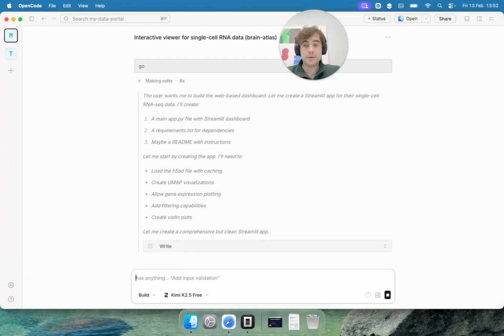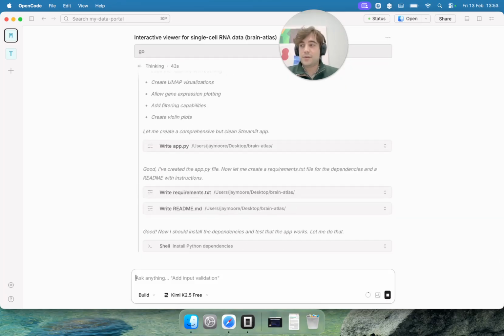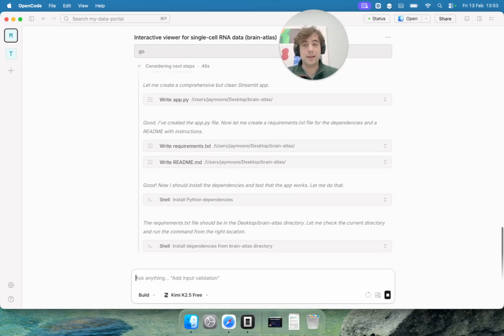Now, if you're going to analyze larger data sets, which are very likely, I would recommend a few things. Firstly, you'll want to maybe pre-compute some things, like determine your clusters before adding all the data, because if it takes, let's say, 5 minutes to run on whatever computing environment you're using when you're using your scripts, it's going to take that time as well when you use it on the website. So figuring out what are the right tasks that are quite quick, often visualizations and highlighting data that's already computed, is the best use case.